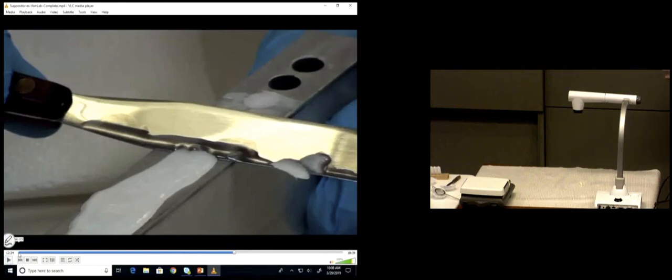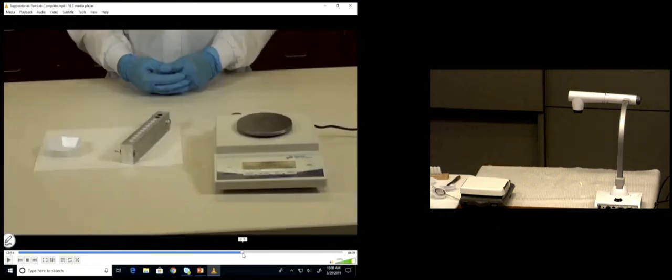And you see where you then pull some of those shavings back in, put your hot spatula on top and rub it in a circle, and what does it do? It melts it and fills it in on top, polishes it, and keeps any chunks or big holes from being in there. You can fill in small holes that way. You can avoid problems with being chopped off there. So again, you'll get twice to be able to practice that, but it takes a little bit of effort, okay?